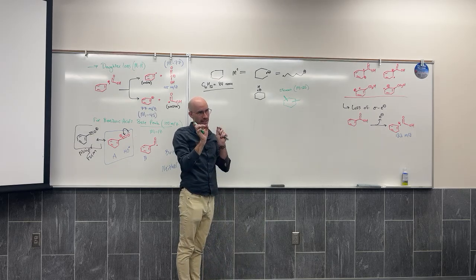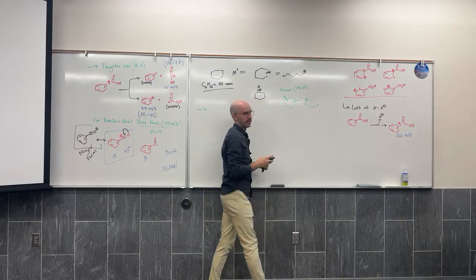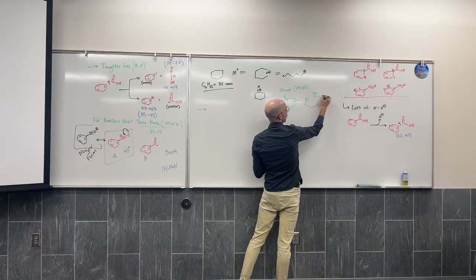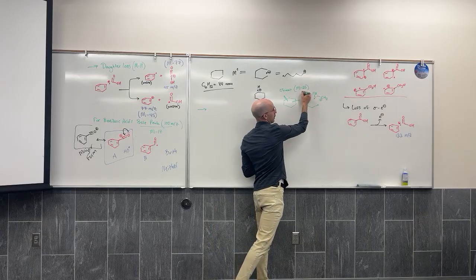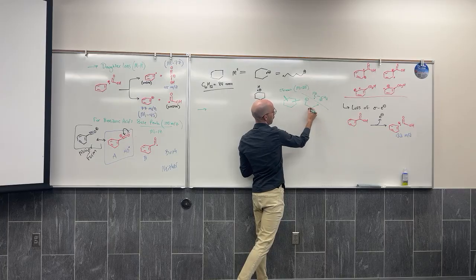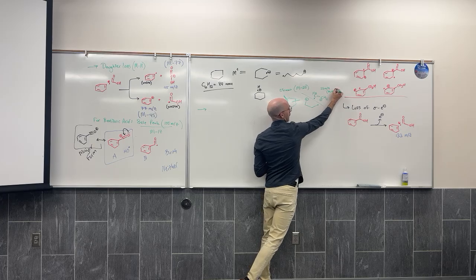Maybe one molecule gets hit twice, and then I'm left with a radical cation that has lost CH2, CH2, which itself could be a radical cation. So if I have a signal at 56, I might also have a signal at 28, M minus 56.